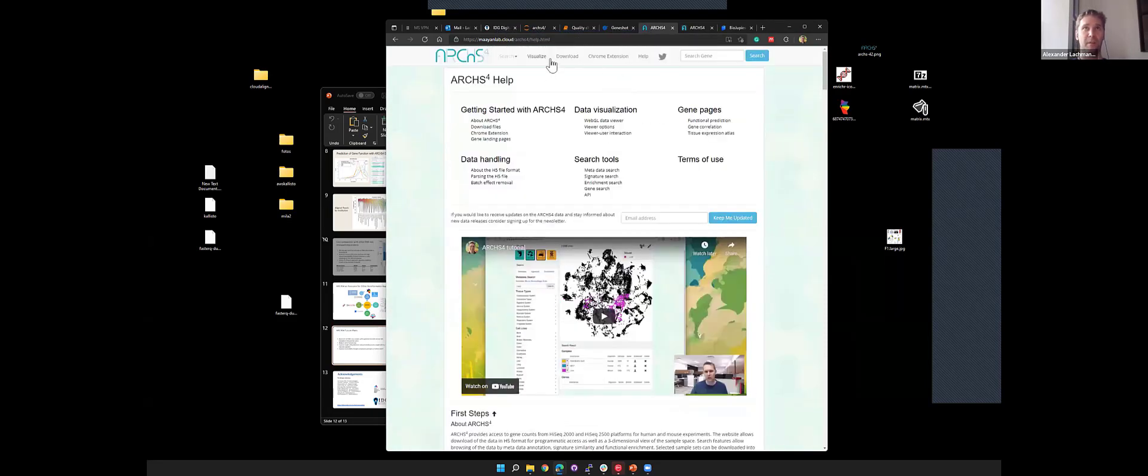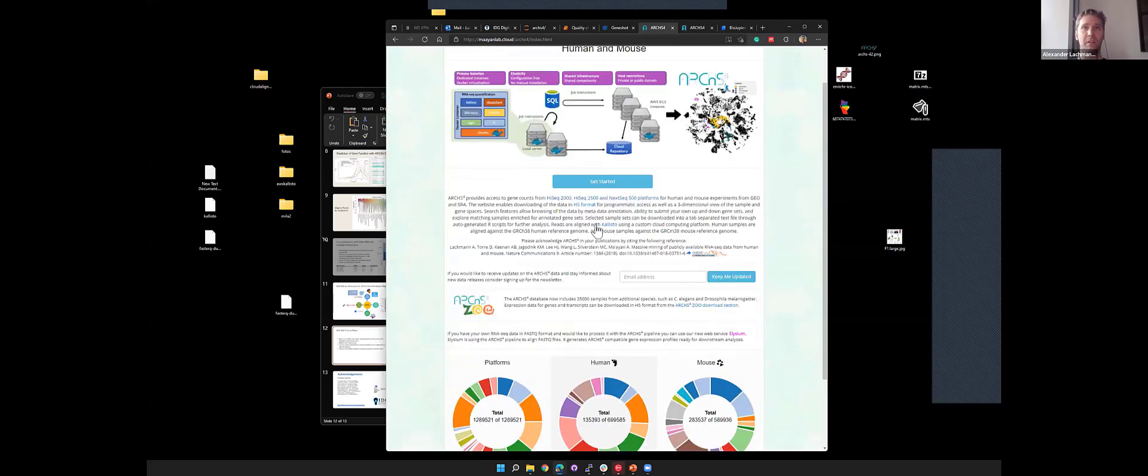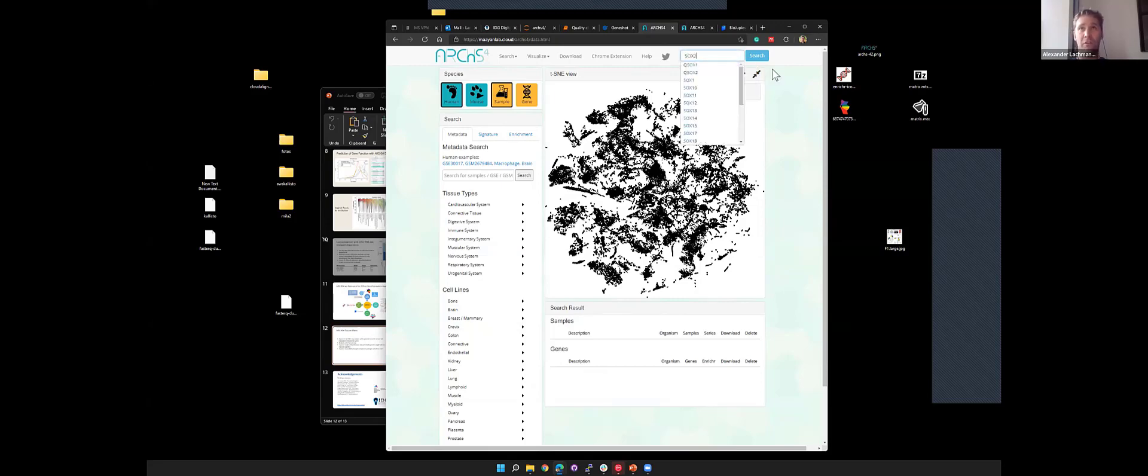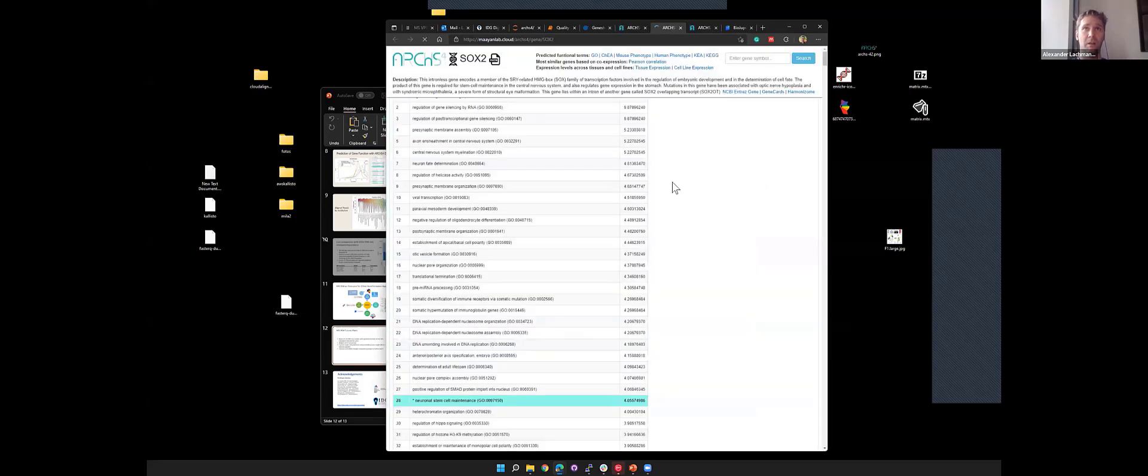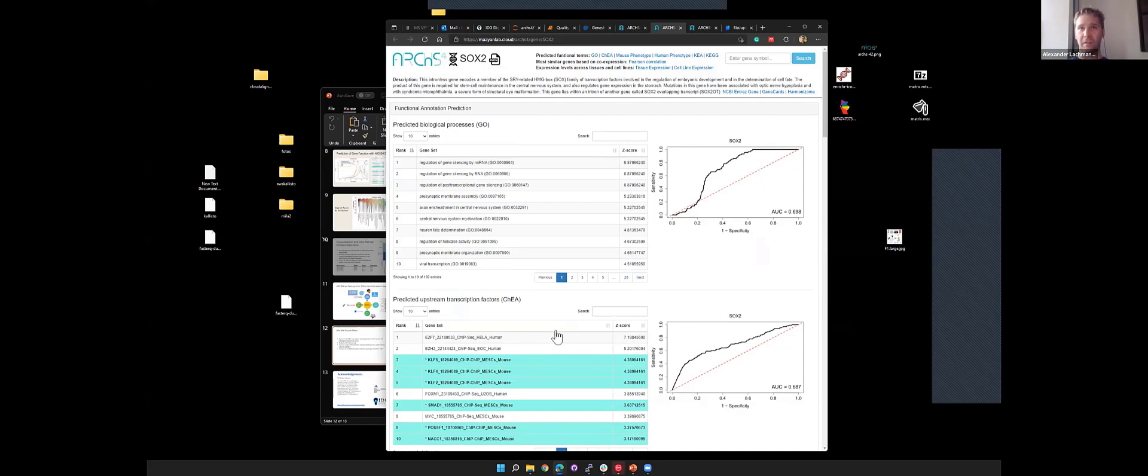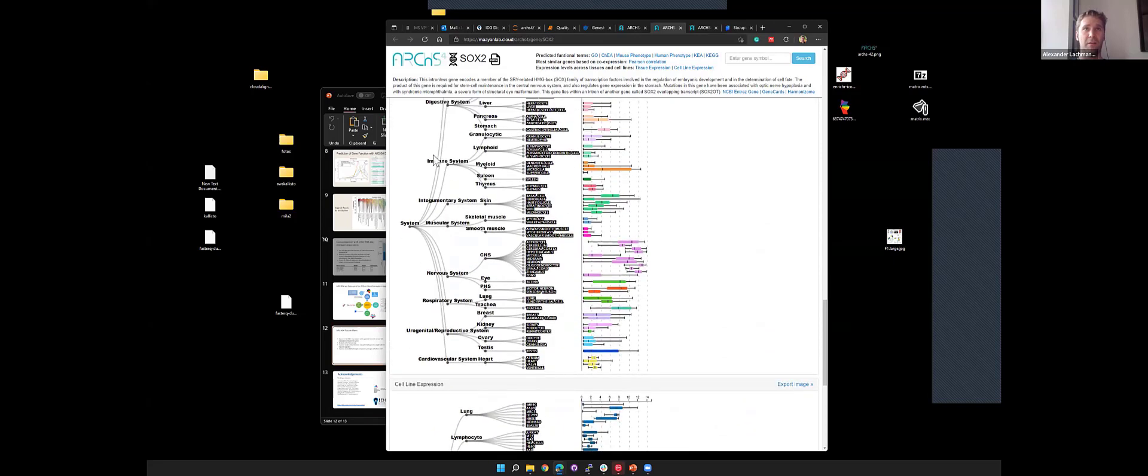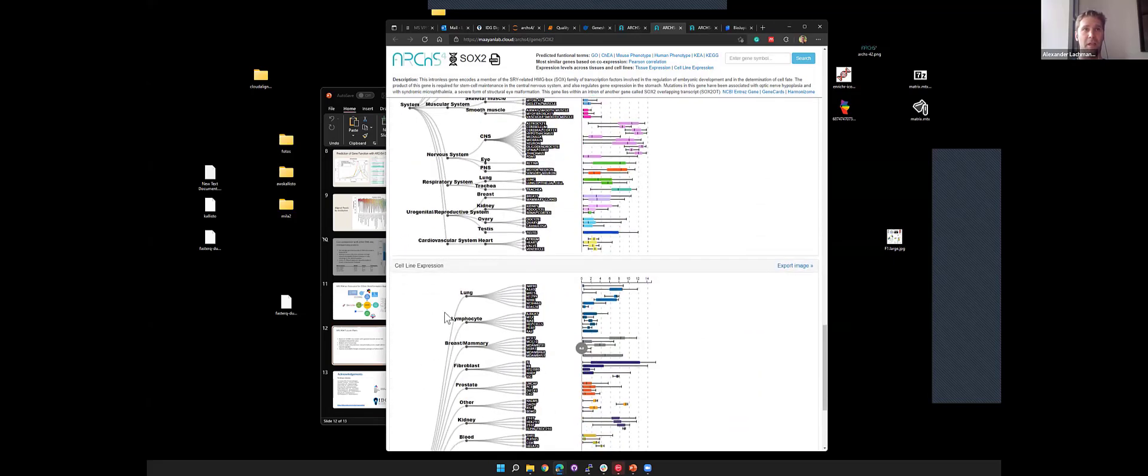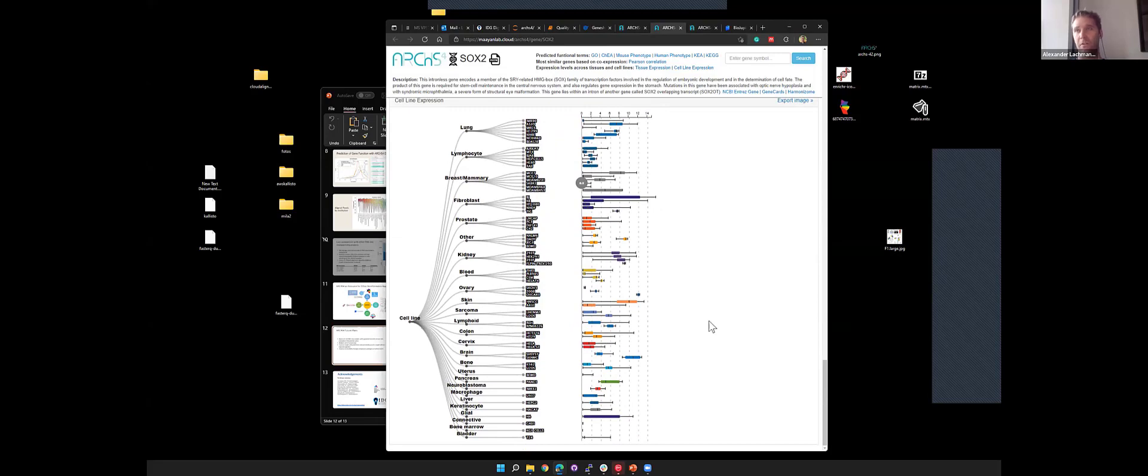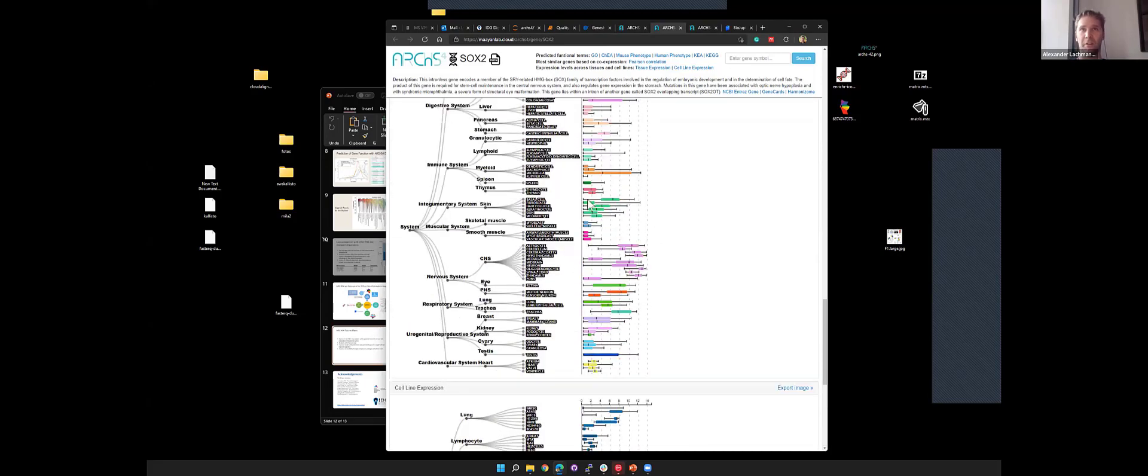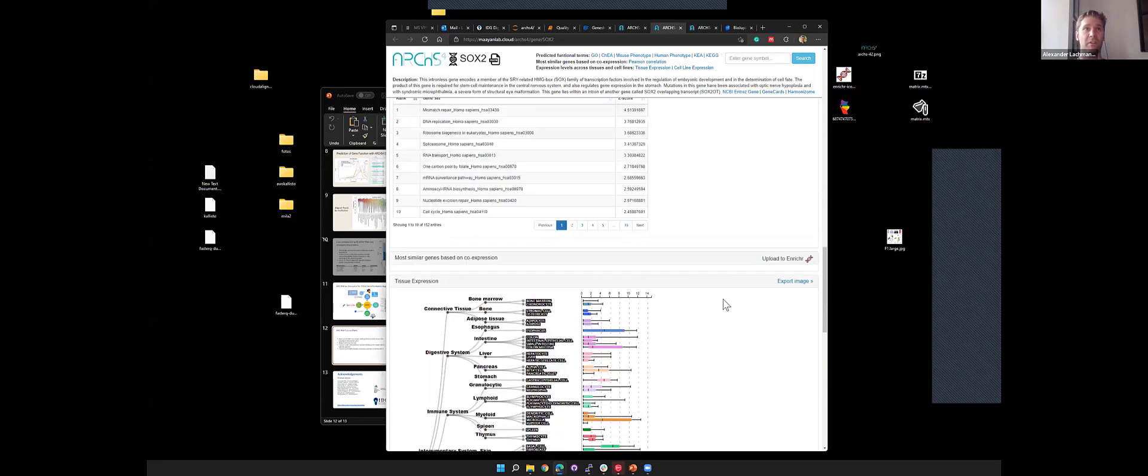We also have gene pages. If we search for an individual gene, let's say SOX2, we get an overview of predicted gene functions. I guess this is also very similar to what we now have in GeneShot, and that's probably more comprehensive than this. But this also has the tissue expression atlas and the cell line expression atlas. If you just want to see in what tissues the gene might be expressed and at what variation or variance, this could be an interesting resource.